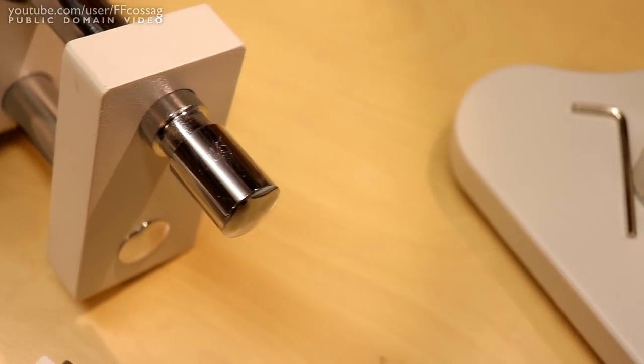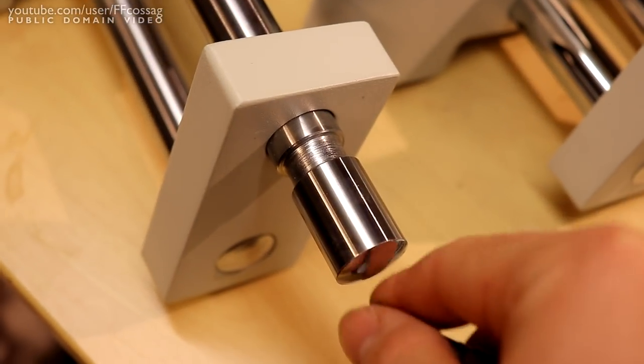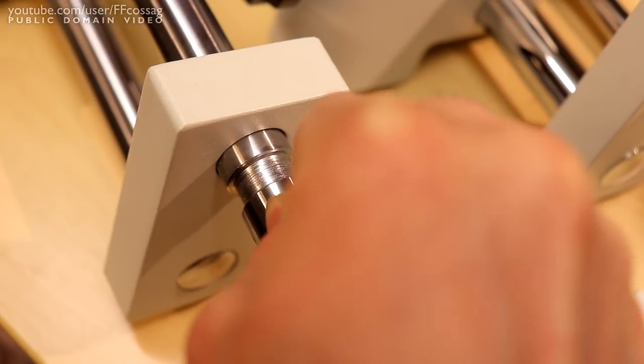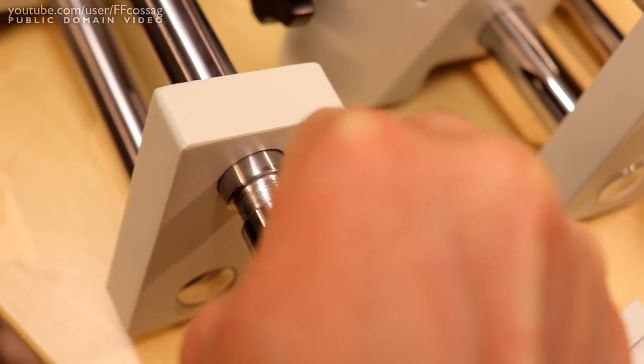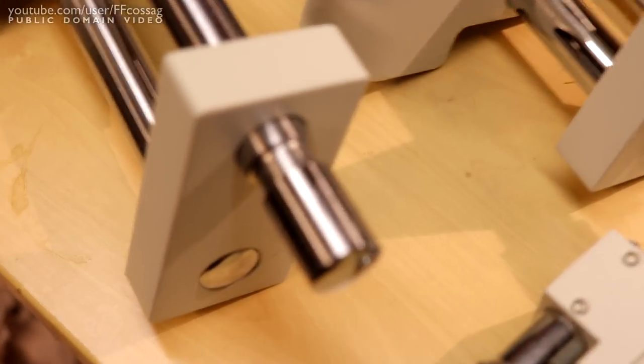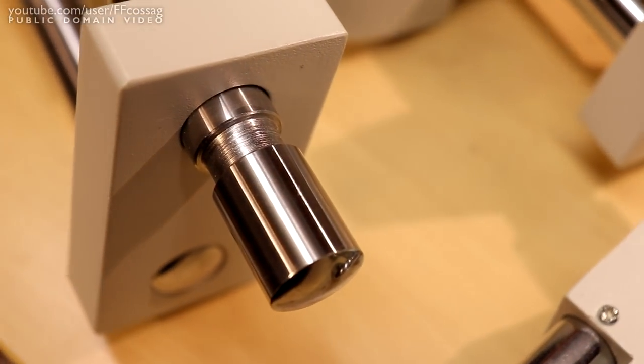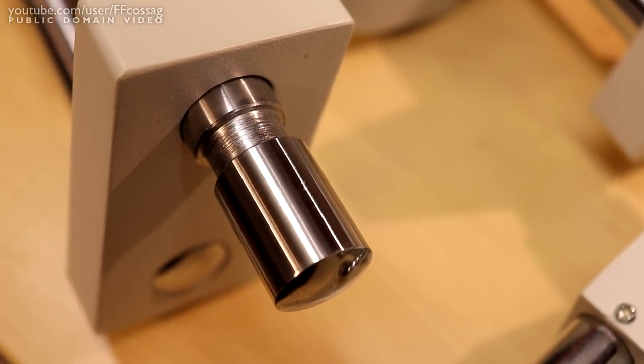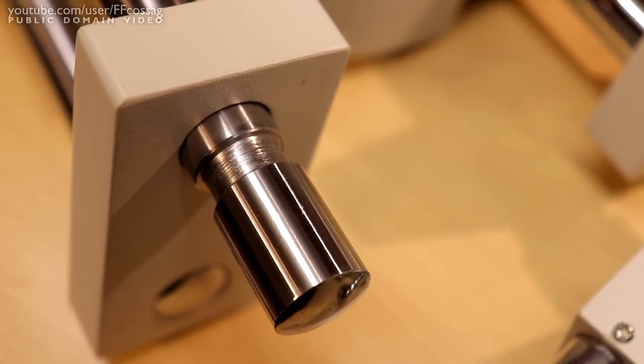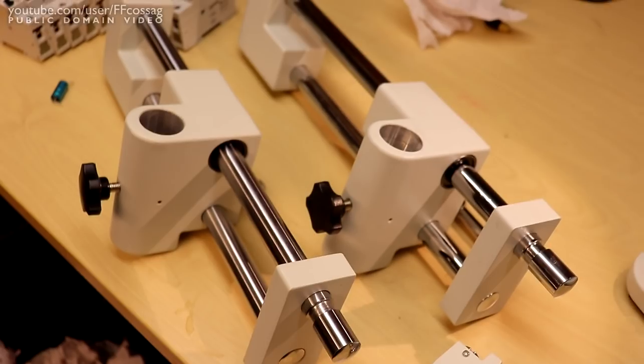But if I take that to this one, I'm really rocking that, really putting down a lot of force. And aside from a bit of dirt and grime getting onto it, it's looking brand new. So they have changed the material now.